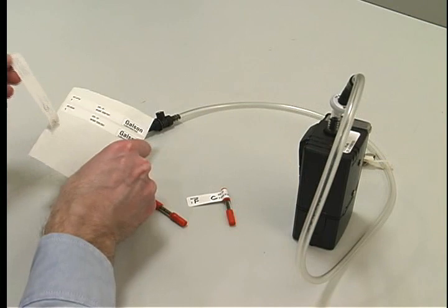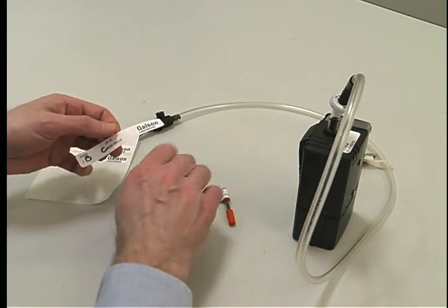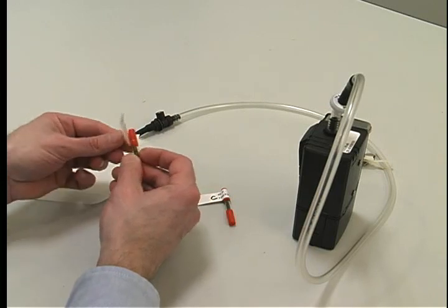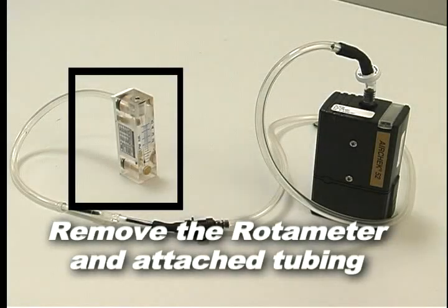Remove the sorbent tubes, cap their ends, and mark them as front and back for use in the post calibration you will be performing after testing is completed. Remove the rotometer and attached tubing.